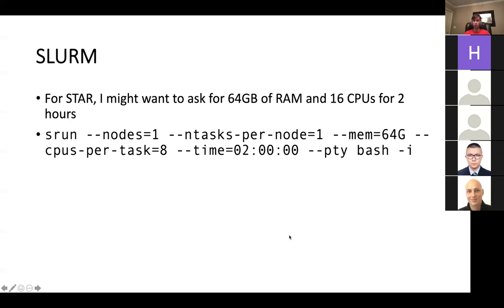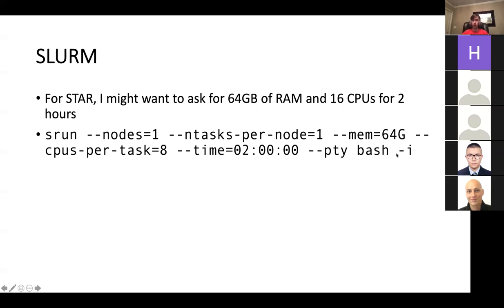There are two ways to run jobs. Today I'm just going to talk about interactive jobs because they're a little simpler to start out with. The command here is srun, which stands for SLURM run. The rest is just specifying what you want: nodes and number of tasks per node can always be one, since you're only running STAR on one sample. Mem stands for memory; CPUs per task is eight — that seems to be a good number, 16 is also possible. Time is two hours, then you specify a bash shell. The minus I stands for interactive, meaning it gives you a terminal on the compute node where you can type commands interactively.